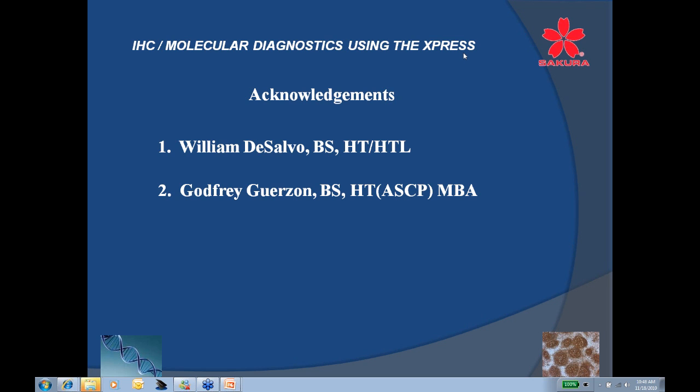Okay, and this is actually another Paraform question, and this is actually from Europe. In Europe, lots of laboratories do their DNA work, like FISH, ISH, and PCR, on FFPE tissues with good results. Does Paraform have any influence on these results, especially the foam inserts on the 13 by 13 cassettes?